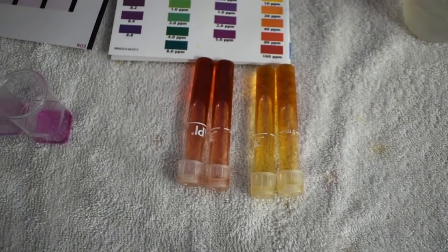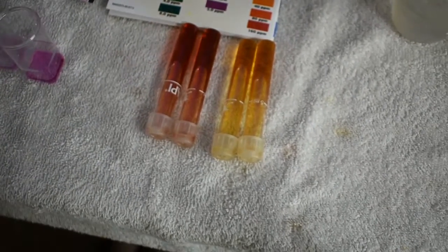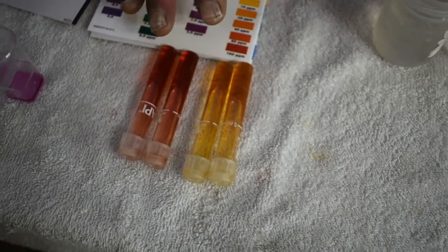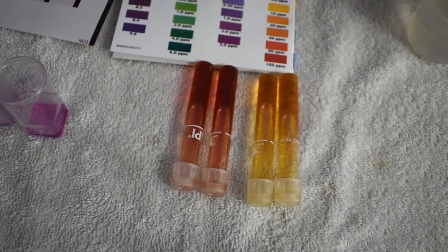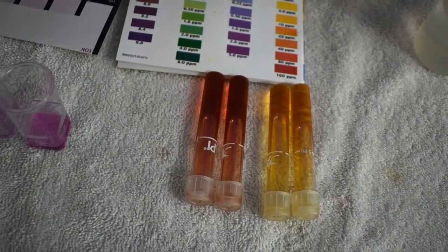That's based on my eyesight and the way I'm perceiving the colors — it may be a little bit different for you. But we know that this one is out of hand, way too high. We need to do something about these nitrates. This other one is moderate — maybe we're getting to the point where we really need to do a water change, especially if it's a reef tank. It's not that bad, but let's take some corrective action.